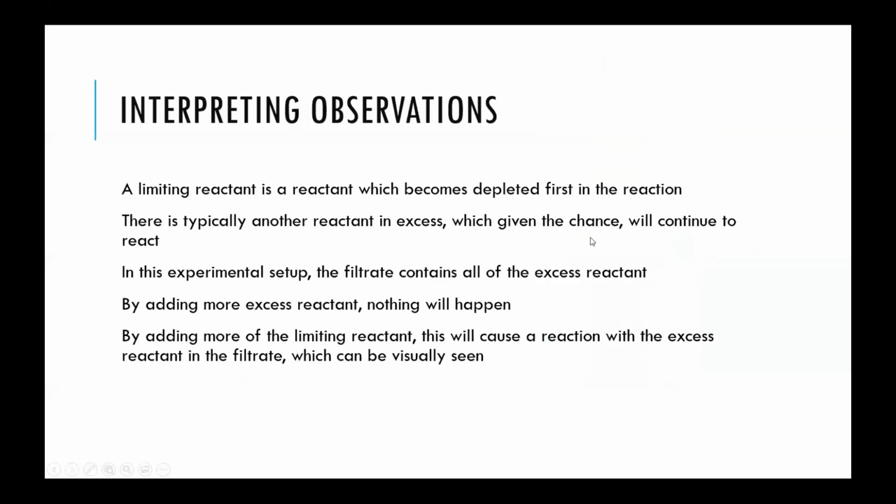So it's whichever one gets depleted first, and is the limiting reactant. And the excess, the extra reactant, those are still ions, and they're able to pass through the filter paper and still be present in that filtrate, in that liquid. And so if you end up adding additional limiting reactant, you'll see a further reaction, and you can figure out, based on those two separate reactions, what is the overall limiting reagent.